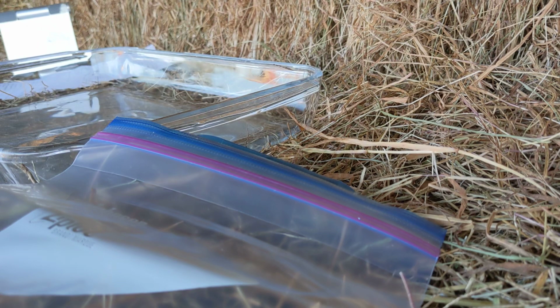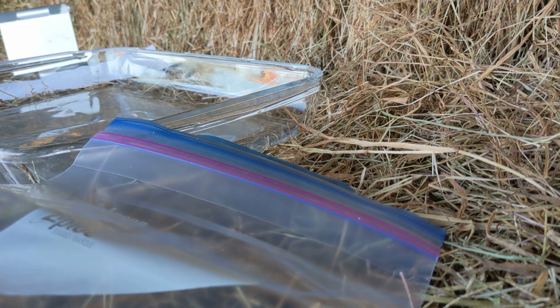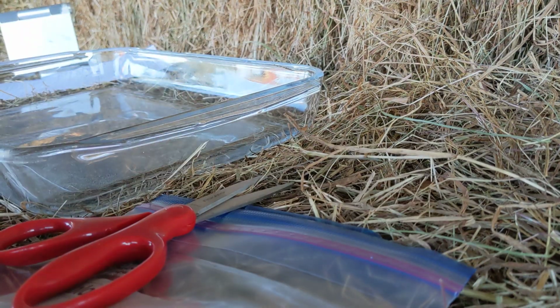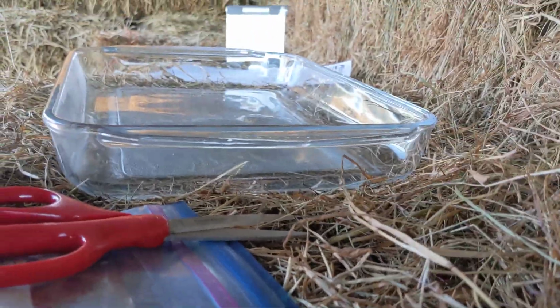And ideally, you'd want to do this with multiple bales so that you can get a more accurate picture of what you're feeding and not just what the analysis for that one bale is. But like I said, I did that yesterday. And I just need a rough estimate.